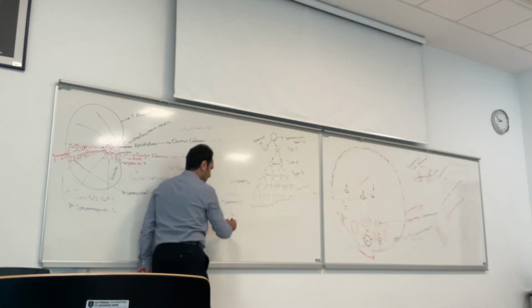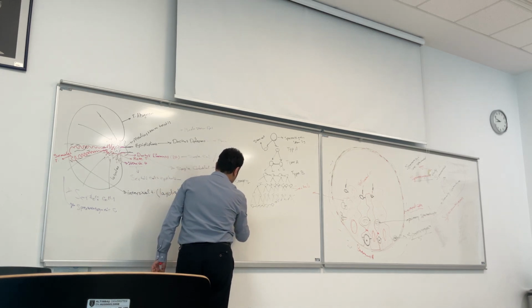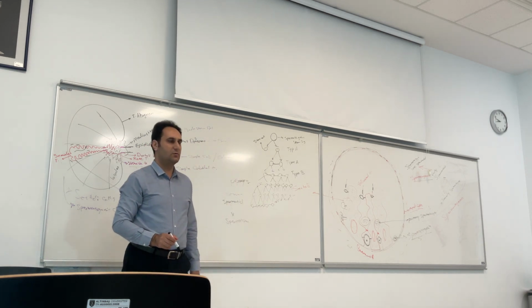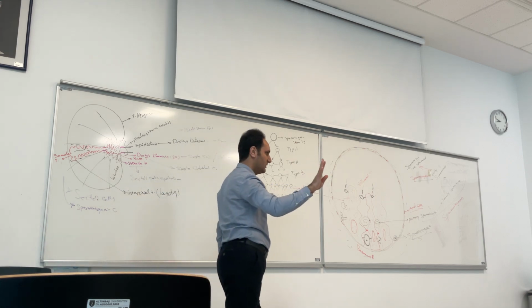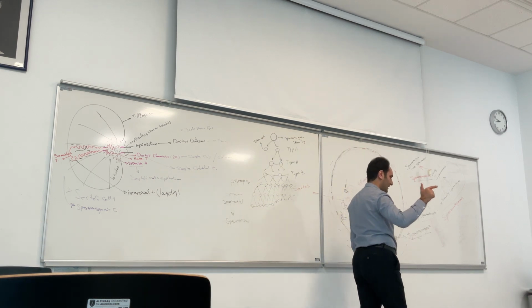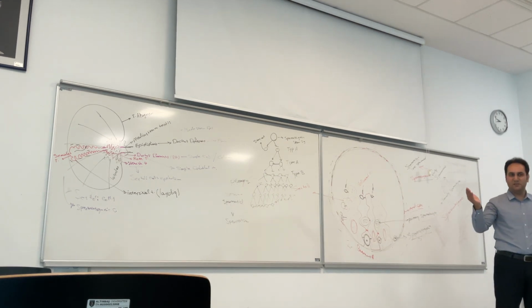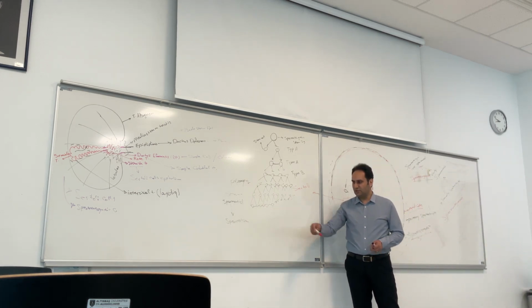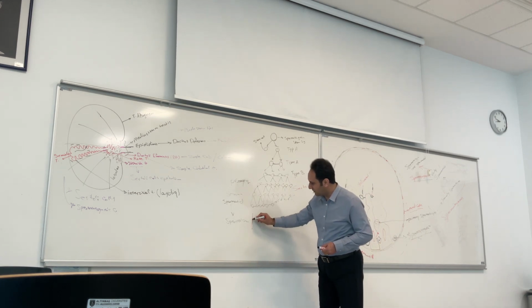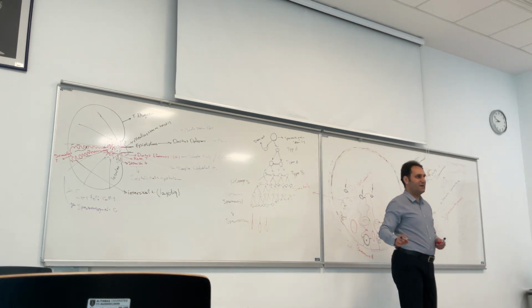During the spermiogenesis, spermatids change into the spermatozoa. During the spermiogenesis stage, we have 4 different stages: the Golgi stage, the cap stage, acrosomal stage, and maturation stage. With these 4 different stages, the shape of spermatid changes into the spermatozoa shape. And we have spermatids with flat view.